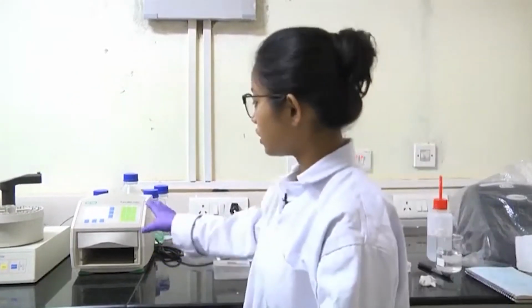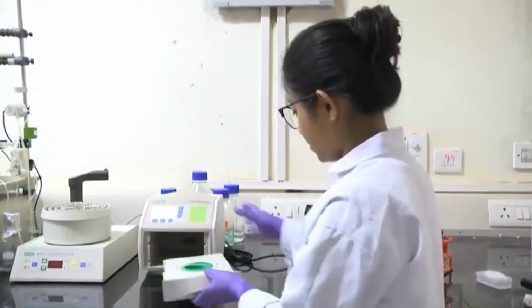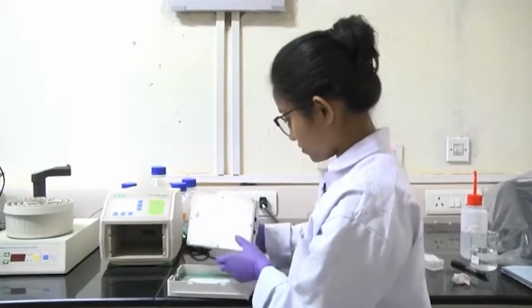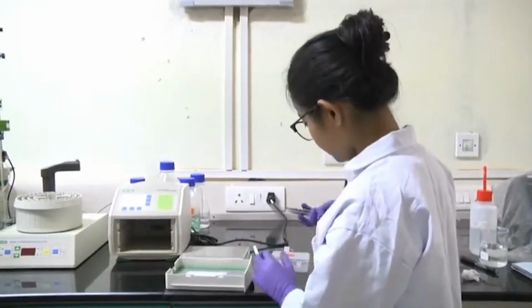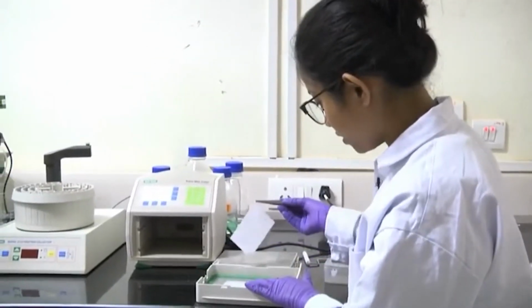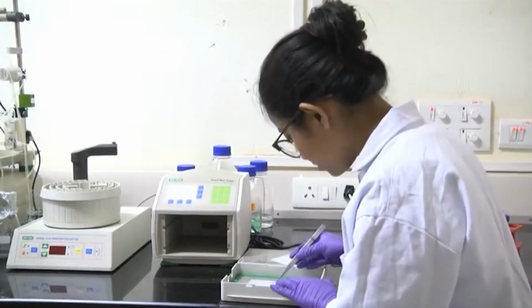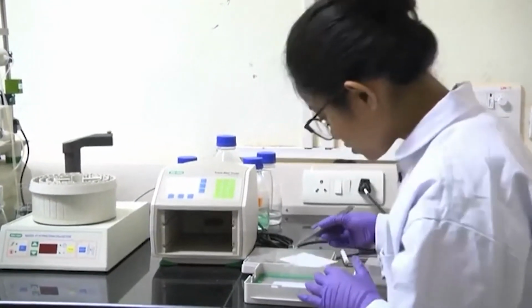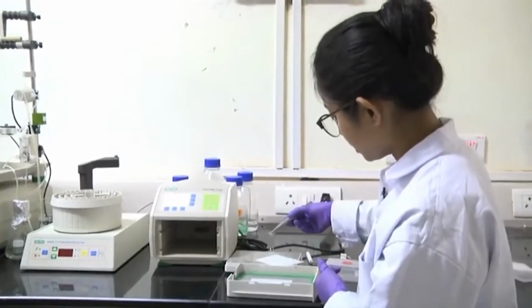So, now what we will do is we will take out the membrane and check if the transfer is done or not. So, in the gel there is no ladder or no protein present.